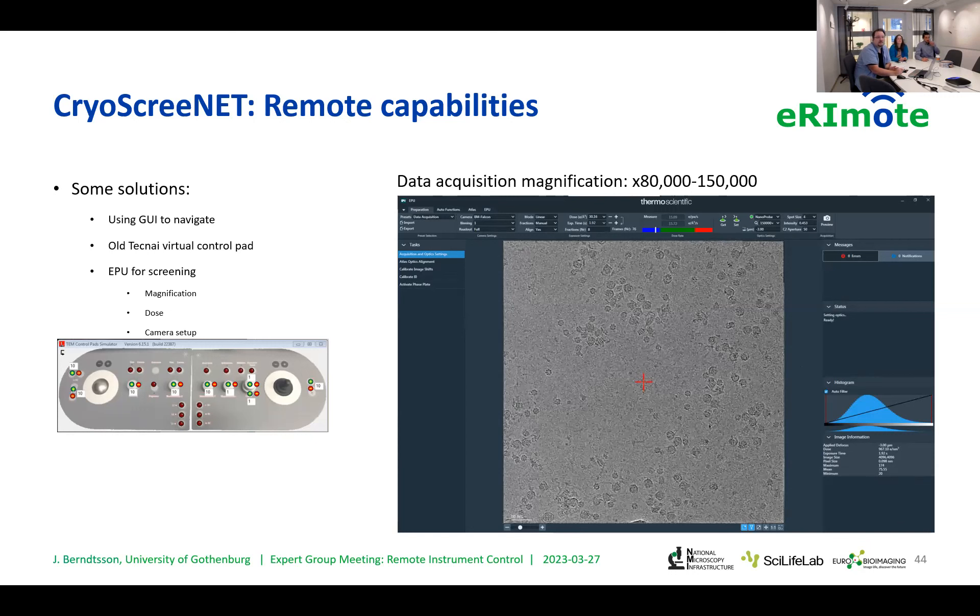Finally, we go into the highest magnification where we actually take our images — roughly 80,000 to 150,000 times magnification depending on the sample. You can see the sample here; in this case, we're looking at a single particle protein.